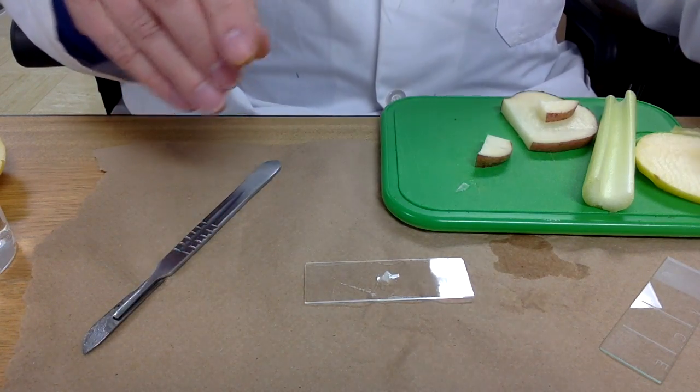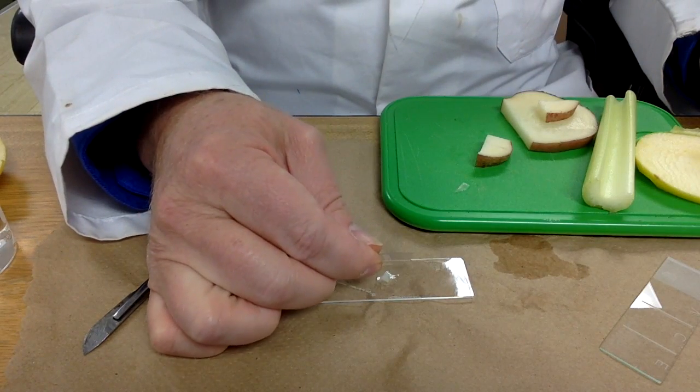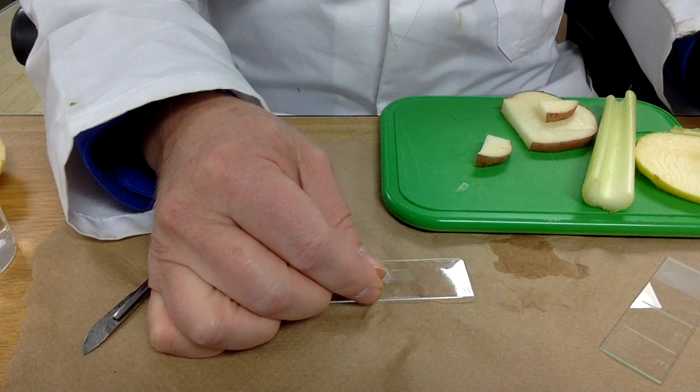Bring a cover slip over. Works well to catch some water. You can see it come under the cover slip, come at about a 45 degree angle.